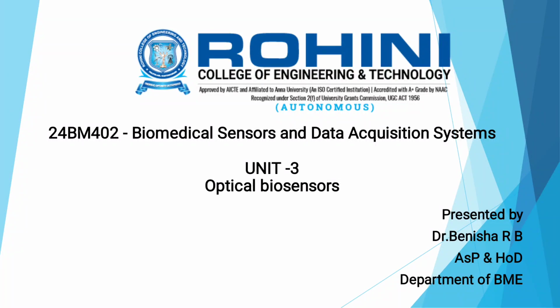In this video, we are going to discuss the optical biosensor. By the end of this topic, the students will be able to understand and identify the primary components, differentiate between the surface plasmon resonance and the fiber optic transduction mechanisms, analyze the biochemical pathways, and evaluate the specific engineering trade-offs with the specific cost.